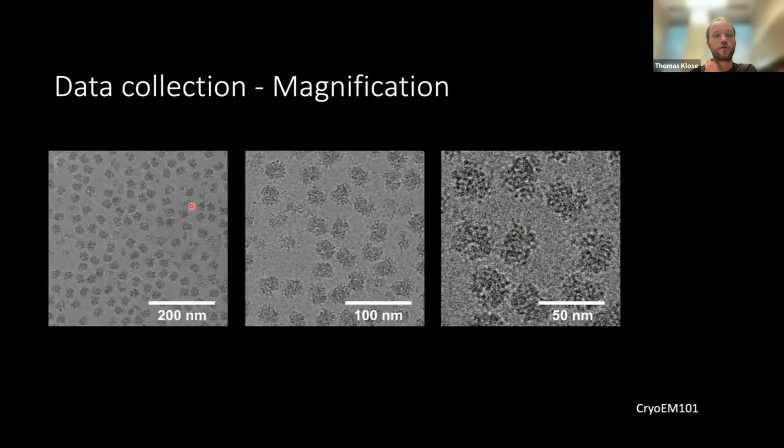So for a high-ish resolution structure, one would probably go with this magnification. And if you want to go really high resolution, maybe with this magnification, but this is probably not practical because it would be too few particles and it would take forever to collect the data.